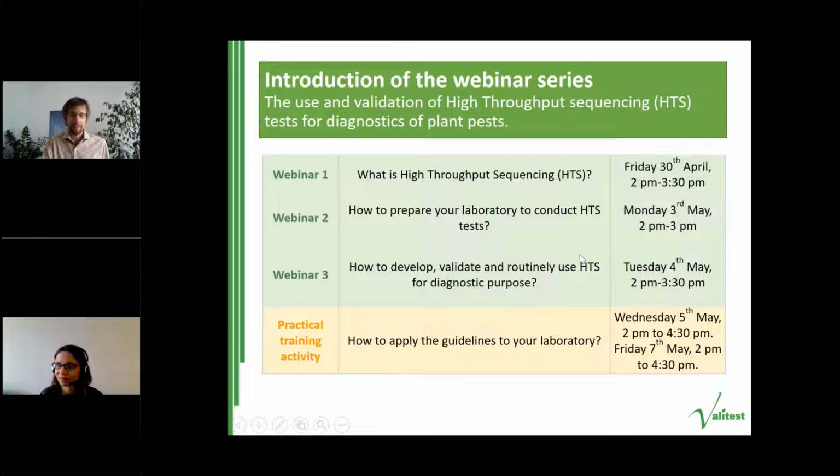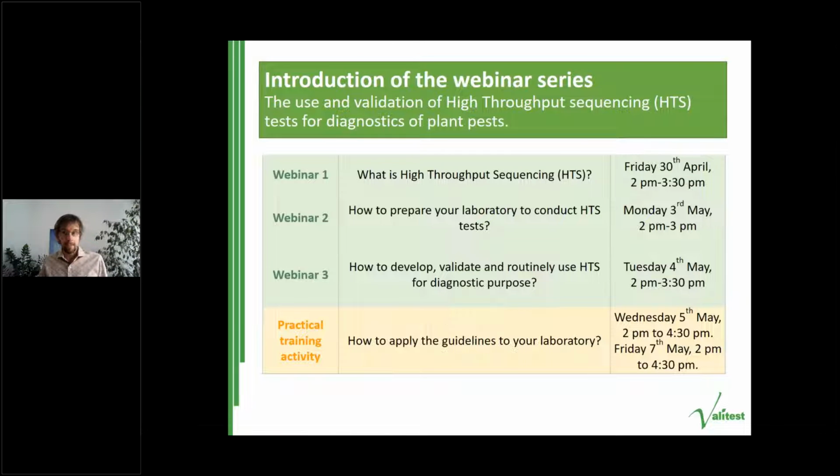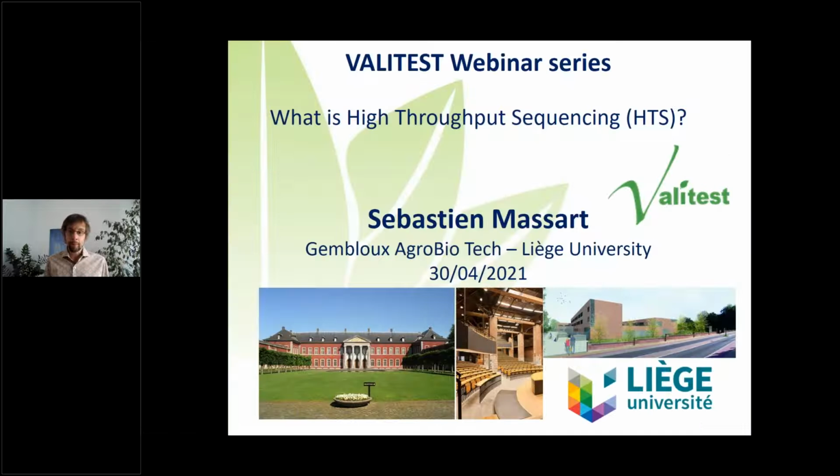Okay, thank you very much, Charlotte. As mentioned by Charlotte, today is an introduction to high-throughput sequencing. If you want to go further, webinars 2 and 3 are still available and open for registration. They will go a bit more into detail on how to prepare the laboratory for conducting high-throughput sequencing tests, and, the third one on Tuesday, how to develop, validate, and routinely use high-throughput sequencing for diagnostic purposes. So today, I will try to share information in order to respond to a single question.